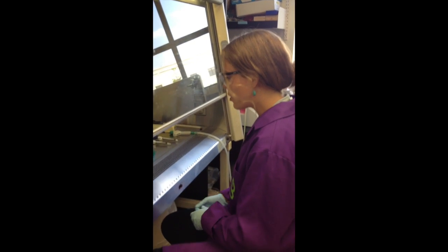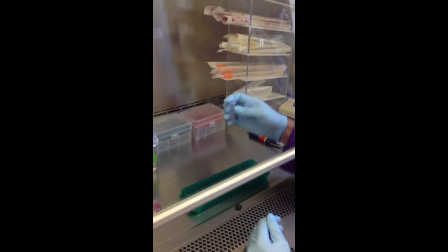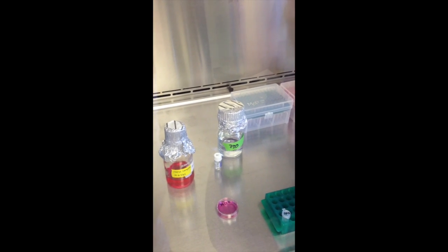Today I will show you how to transfect mammalian cells. I already prepared this tube that contains DMEM complete media with 10% FBS.